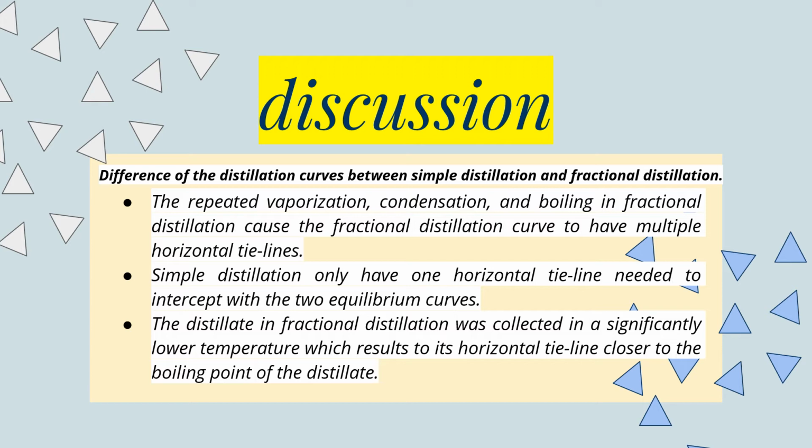Additionally, due to fractional distillation producing a purer distillate compared to simple distillation, the distillate was collected at a significantly lower temperature. This is presented in the graph, wherein the horizontal tie line is closer to the boiling point of the distillate.